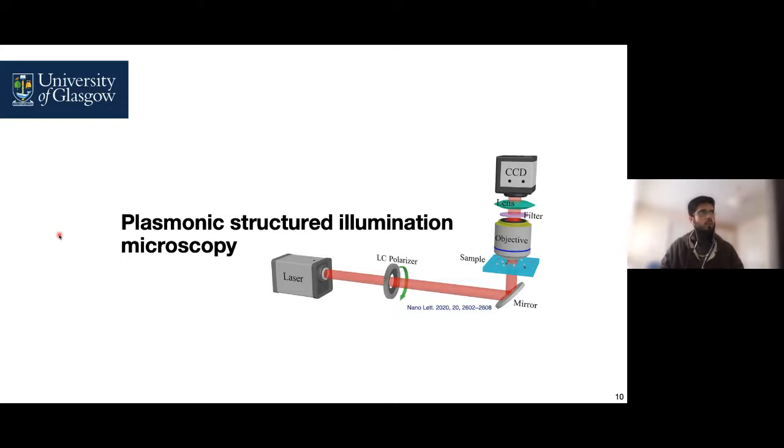We will be talking about a special type of microscopy called structured illumination microscopy. Before we delve into it, in conventional microscopic techniques we have a sample stage on which we put whatever we would like to observe.